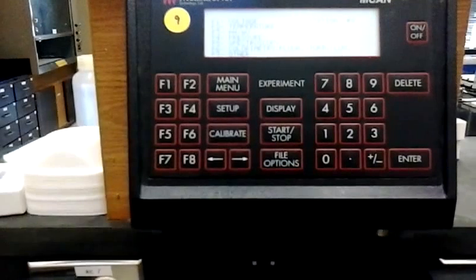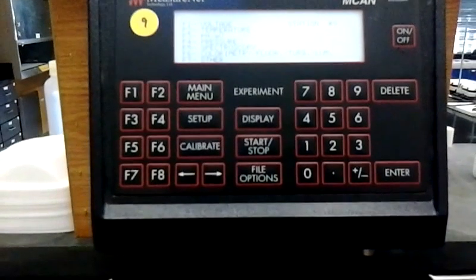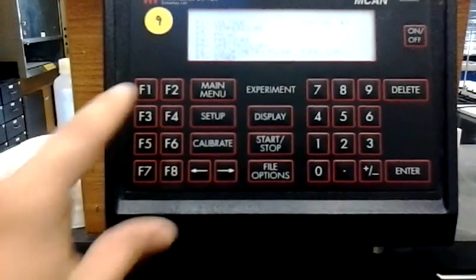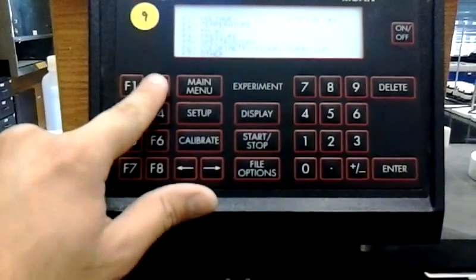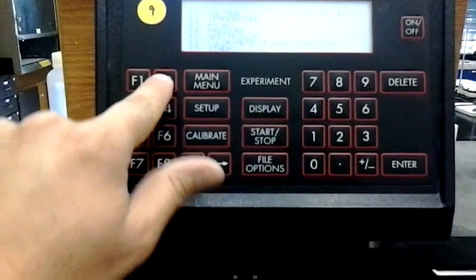We'll be using the temperature menu, so you need to press F2. So right here, hit F2.